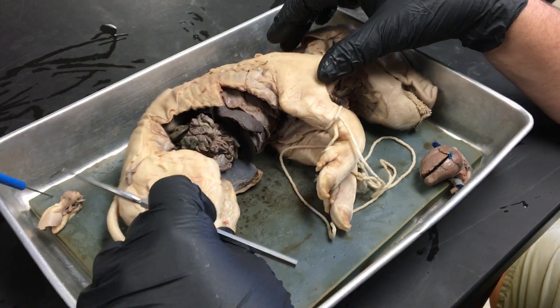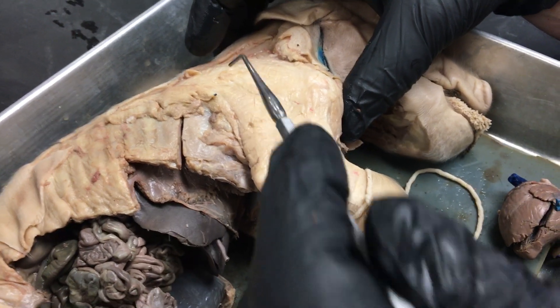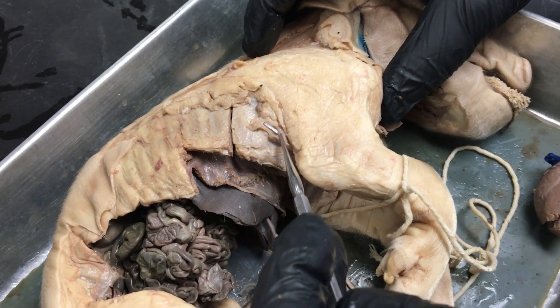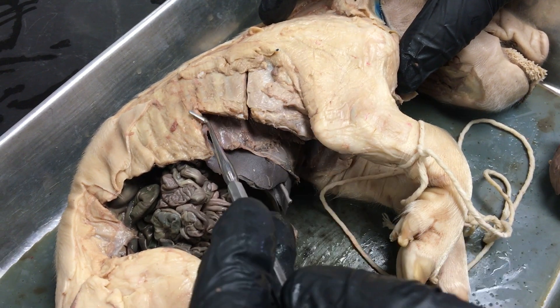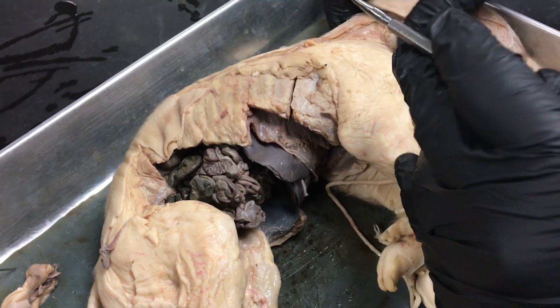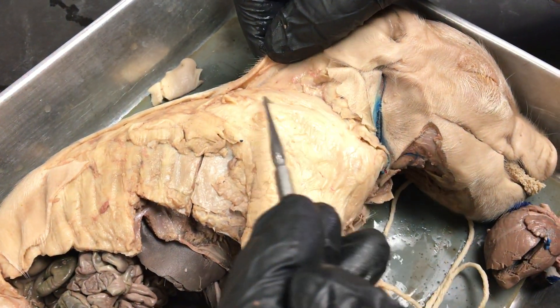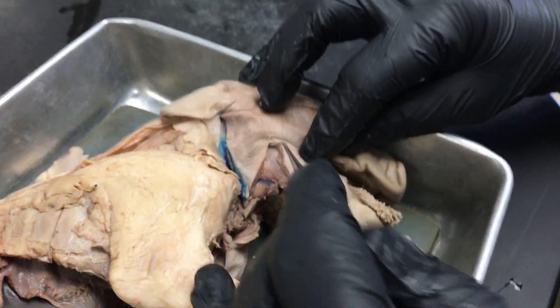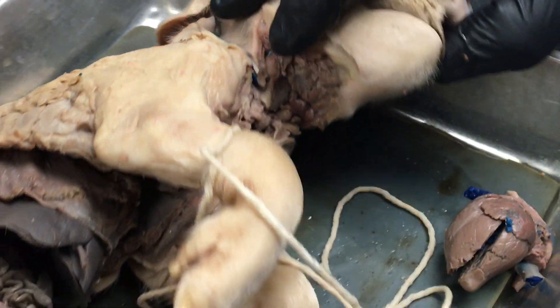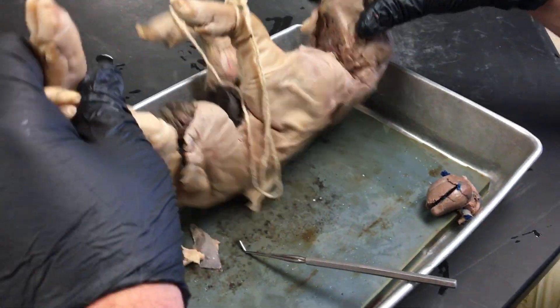Moving to the inside, we'll take a look at some of the muscles. Here we have the triceps brachii and the deltoid. What's left of the latissimus dorsi is right here — it was a nice thin muscle but it's gone. The external oblique has also been removed. We have a trapezius that is not well defined up here. Another muscle that's not well exposed is the masseter — the cheek muscle should be found right here, but the dissectors did not complete that task appropriately.